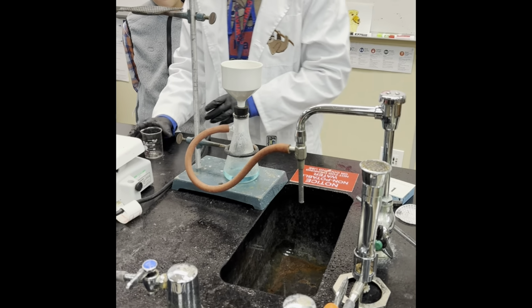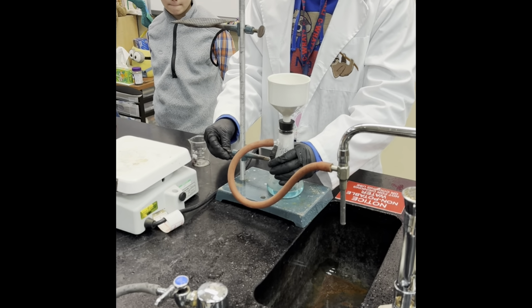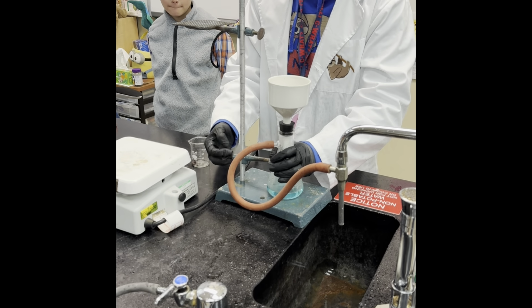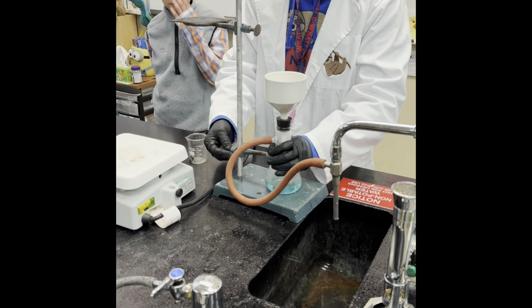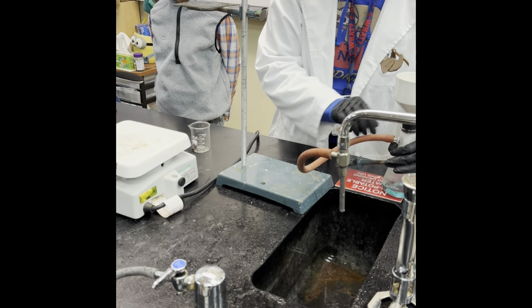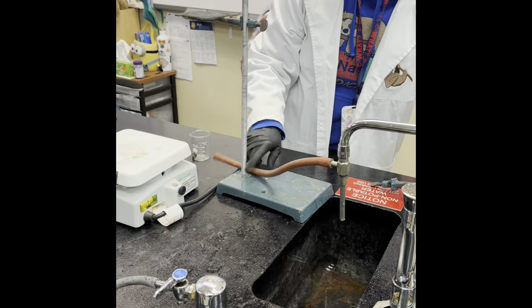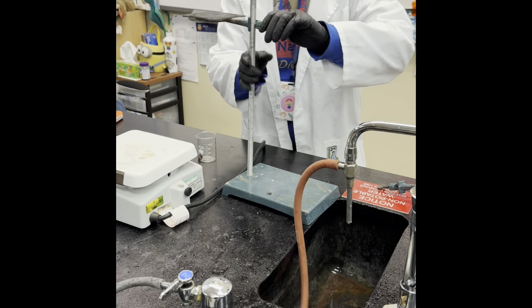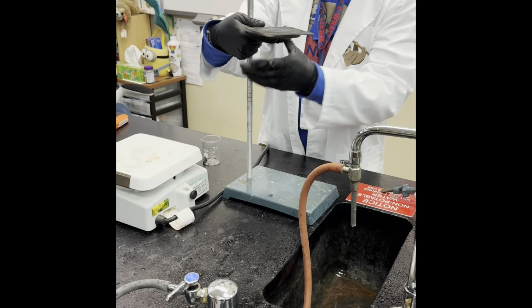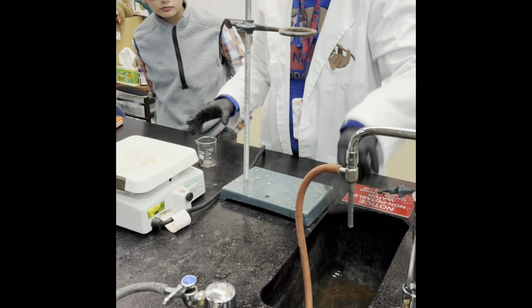Because we're trying to figure out which product we make. Did we make, which proportions did we get for our products, okay, for the copper? So what is the balanced chemical equation for reacting copper sulfate with iron? We're dropping things all over the place.